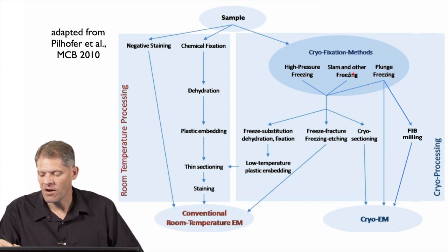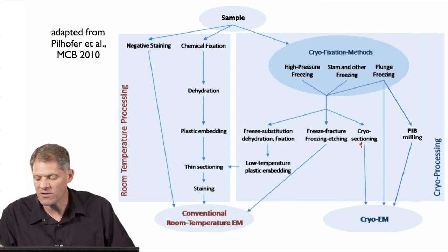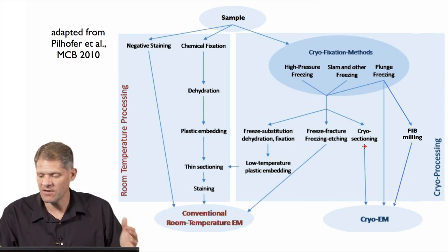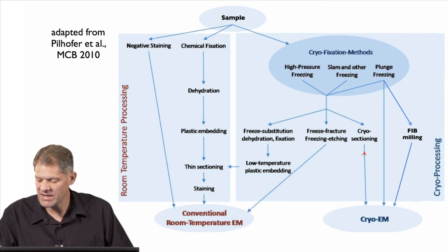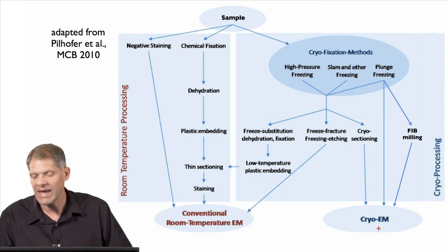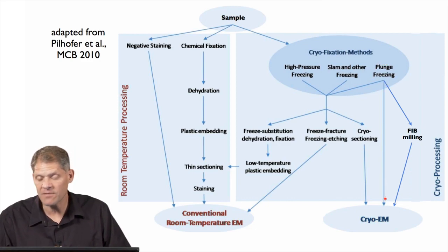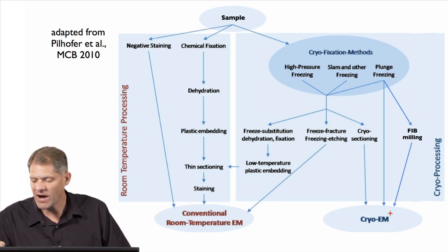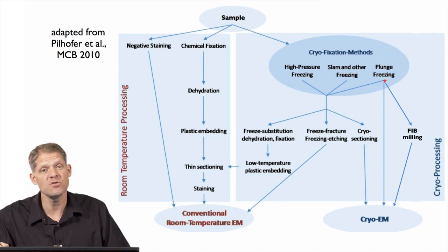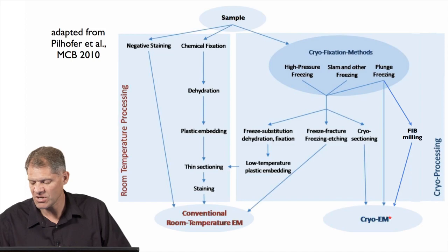These samples can also be sectioned at low temperature while they're frozen. They can be cryosectioned, and then they are thin and frozen. And as long as they're maintained at freezing temperatures, they can be inserted into a cryo-EM and imaged in a frozen hydrated state. Finally, plunge frozen samples, if they're thin enough, can be immediately inserted into the cryo-EM and imaged. And finally, a plunge frozen sample that's too thick to be imaged through can be FIB milled and then imaged in the cryo-EM.